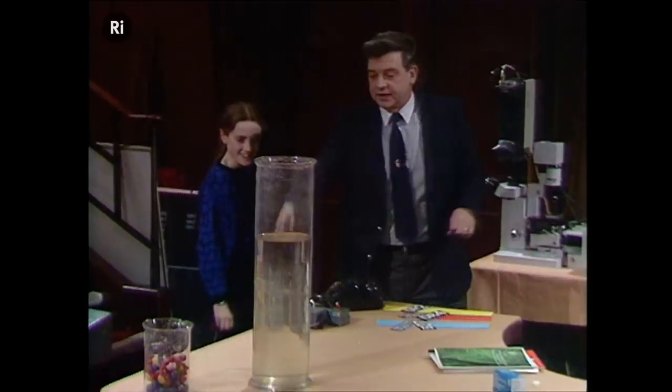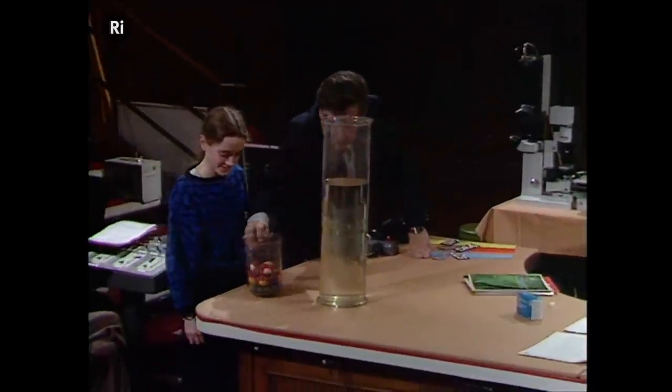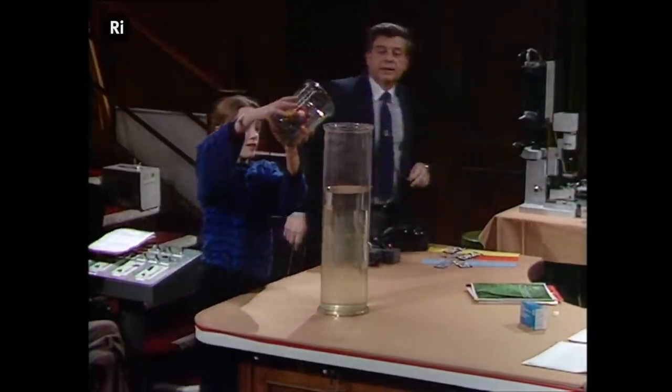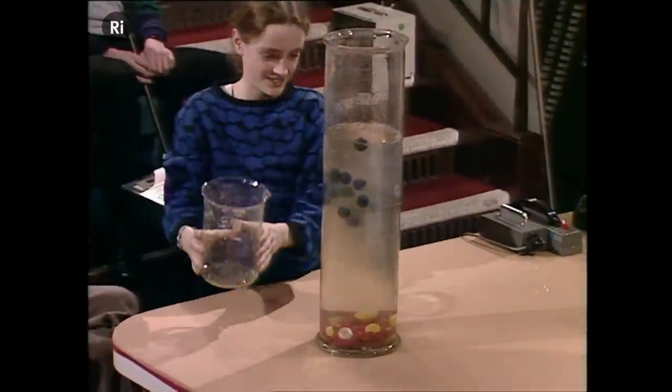Now, Helen, you're going to do an experiment here. There's your sample of blood, right? Your sample of blood there, and it's got a mixture of different sorts of cells. You get hold of that, right? Now, you're going to pour it in here. Pour it in there. All the way in, and let's see what happens.